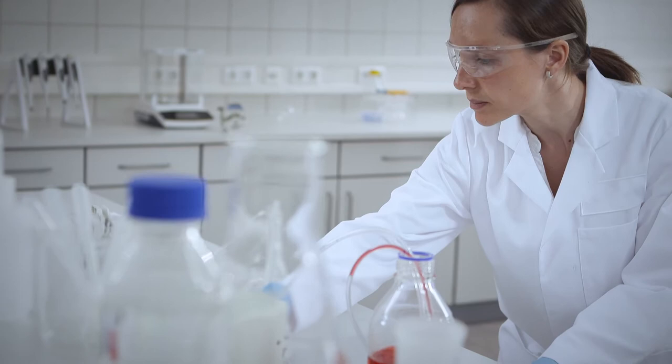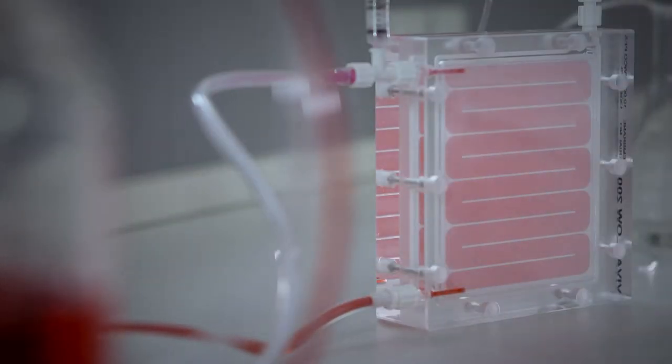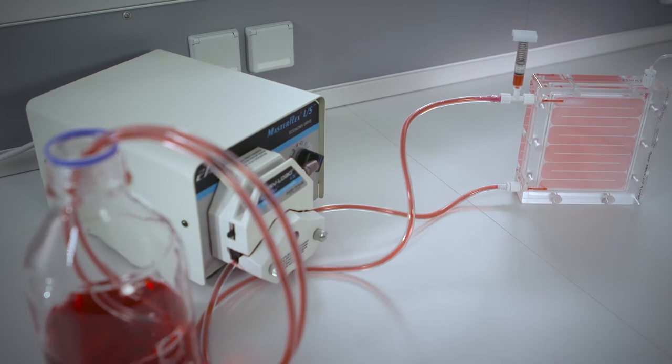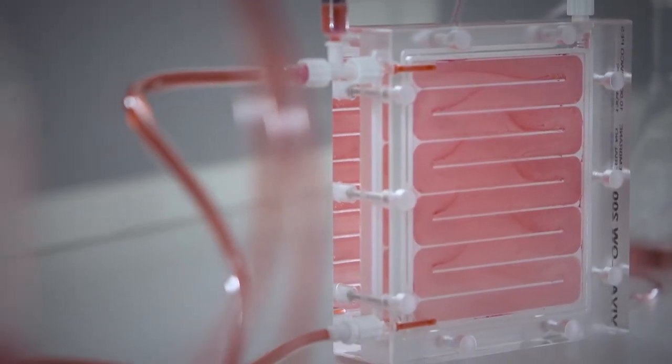To start a concentration run, switch on the pump connected to Vivaflow 200 and slowly increase the pump speed until a pressure of 3 bar or 45 psi is displayed at the outlet. The crystal clear housing enables you to see how the sample flows through the channels of the Vivaflow 200 and is recirculated within the system.